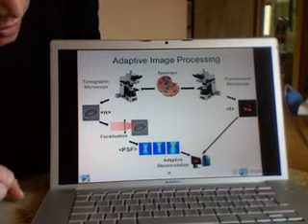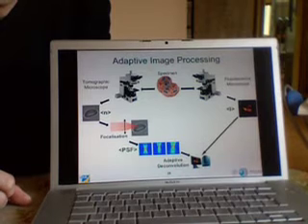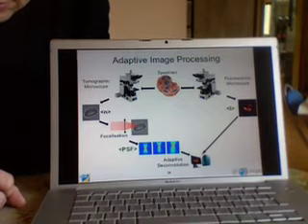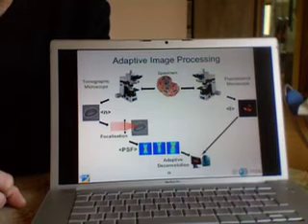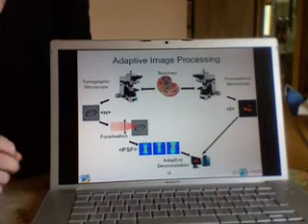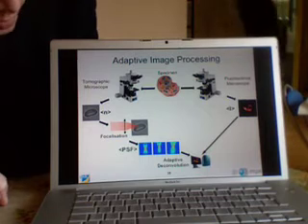So really the computer is at the heart of such a system. Cool. So your research is very curious, because you can observe things directly in 3D. Yes, that's really the idea of this system. Without moving the specimen or the objective, we are able to reconstruct a 3D object.